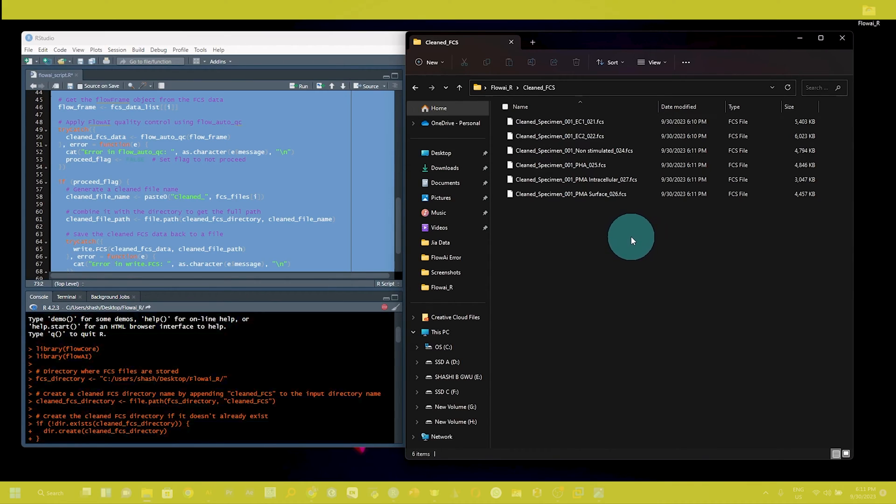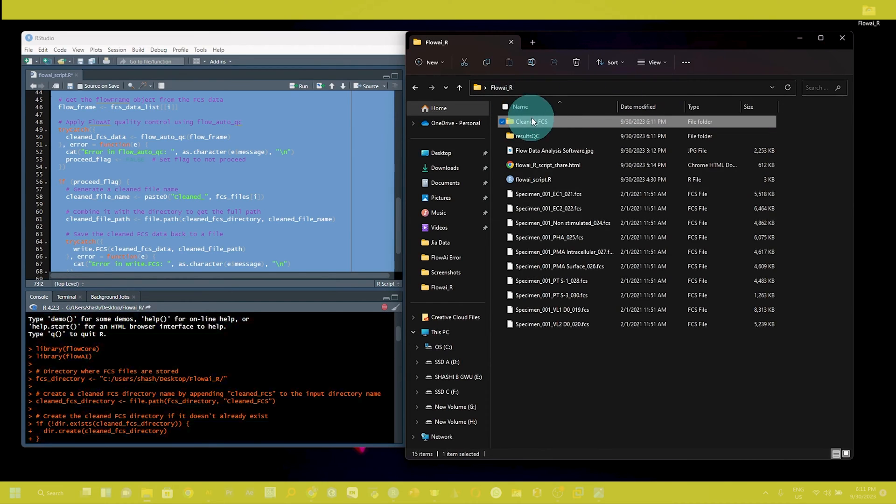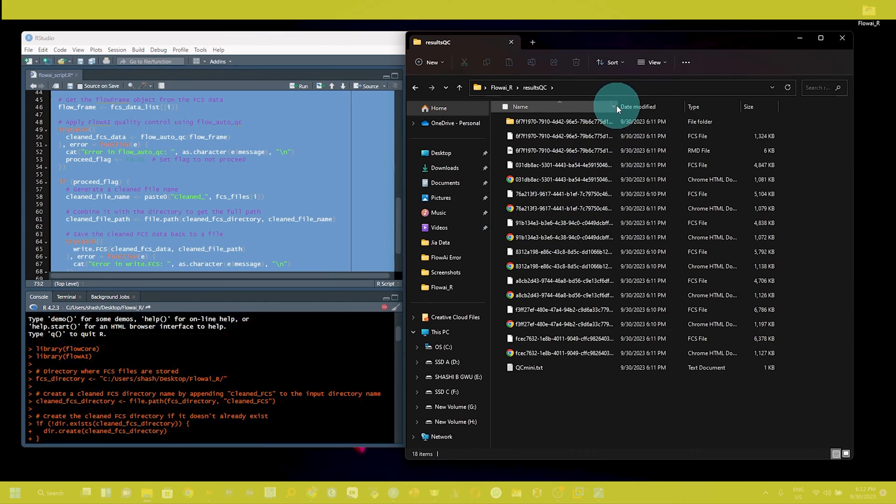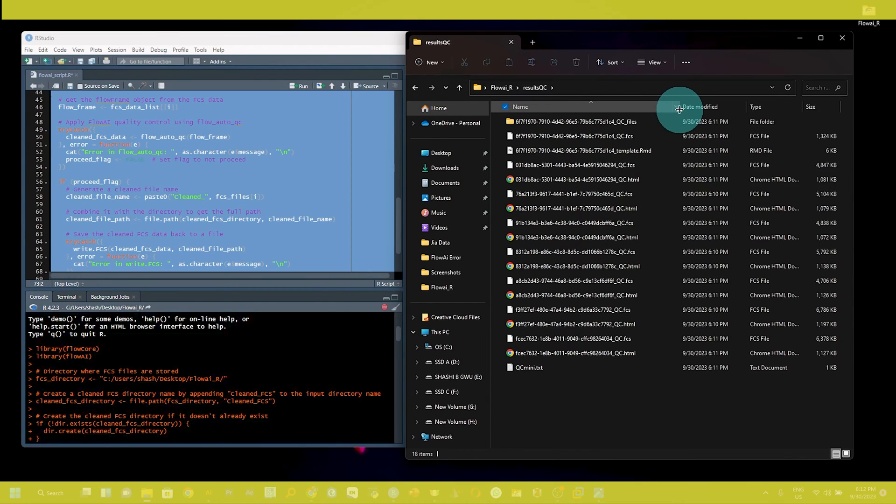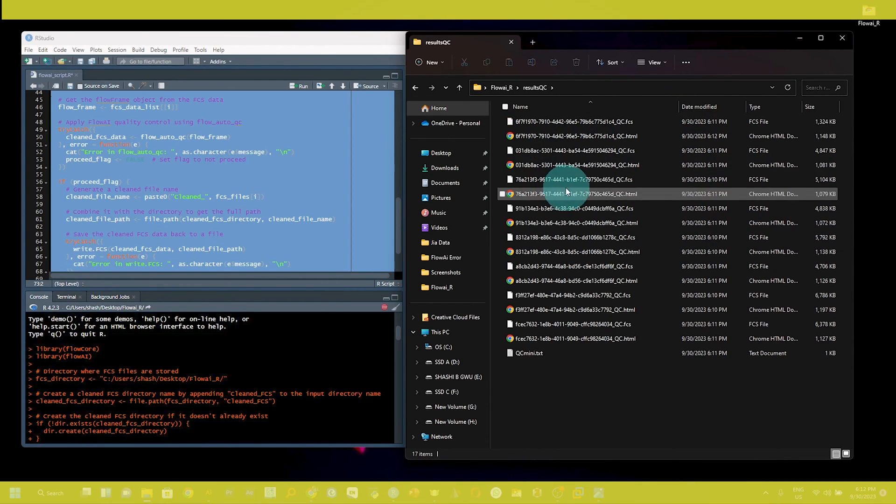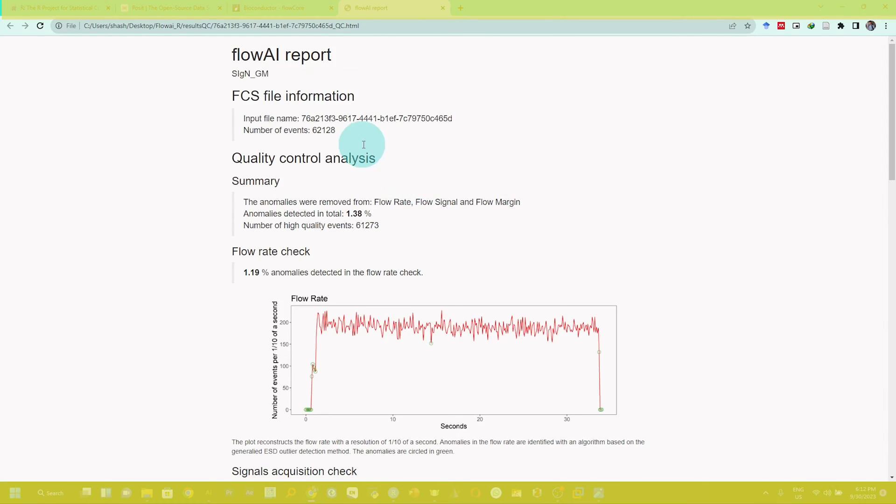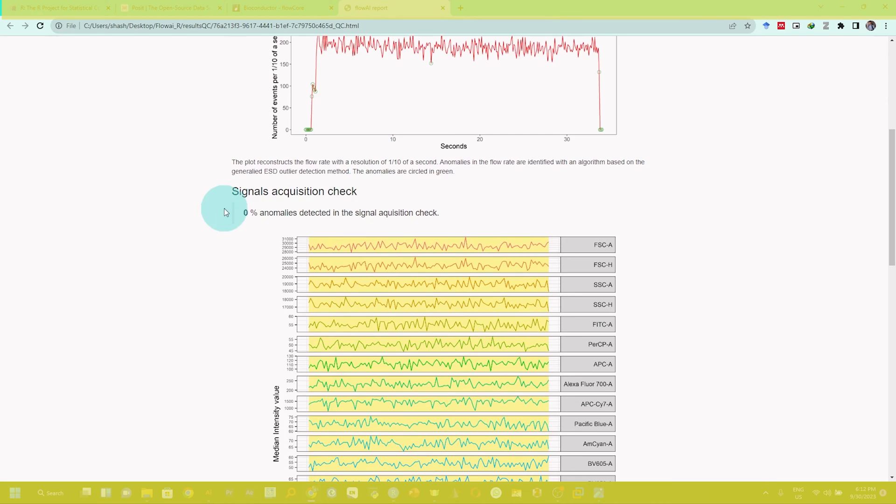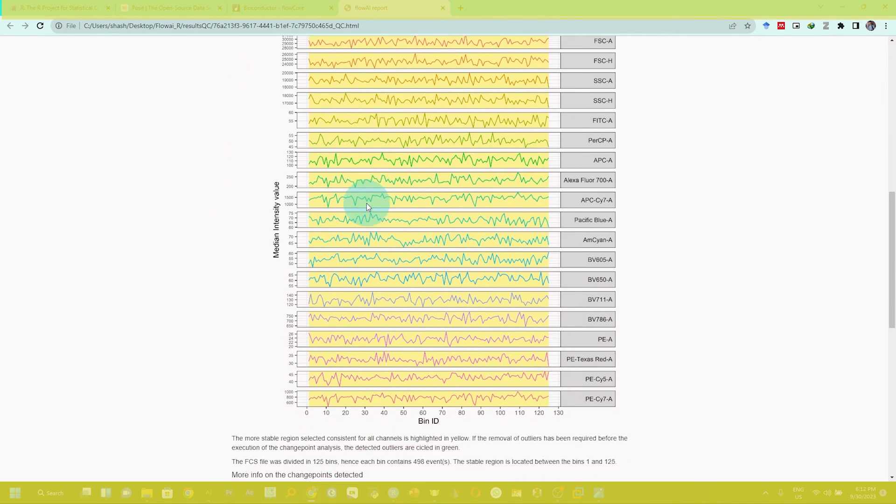If you go back and open the result qc folder, you can see this also generates the qc files in HTML format. If you open this, you can see the detail of cleaning file information: quality control analysis summary, flow rate check, signal acquisition check, dynamic range check.